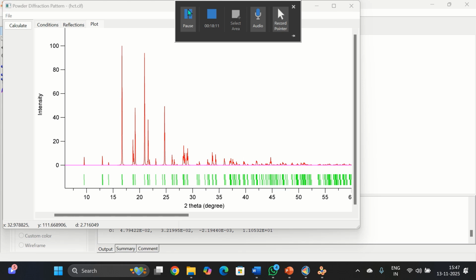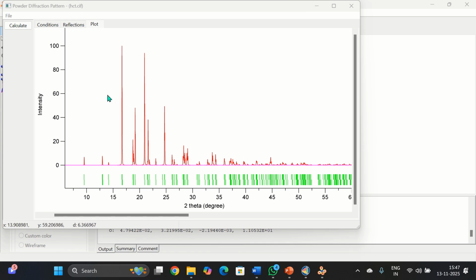So this workflow, starting from the HKL and INS file, generating the electron density, solving the structure, refining it, and exporting the report to other software. In this case, we have used Vesta, visualizing the unit cell and simulating the XRD pattern, which provides a complete verification of the compound's identity and crystallographic purity.